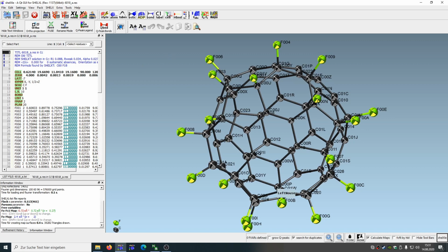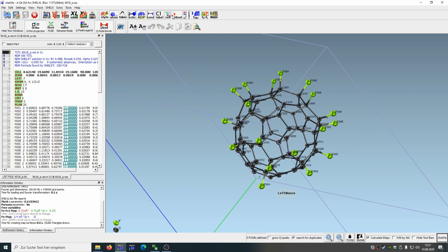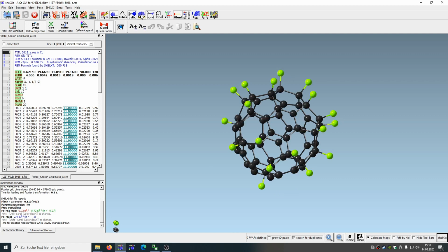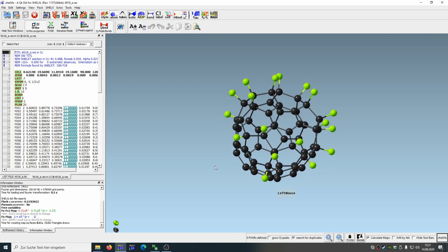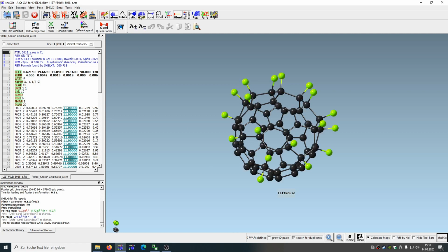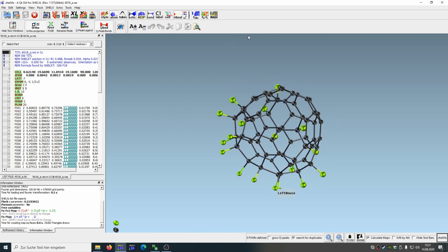Of course, you can have the unit cell box around it, or you can switch off the labels, the bonds, or you can have ADPs or normal style. In this case it's ball and stick, but you can switch to tubes. Many options over here.